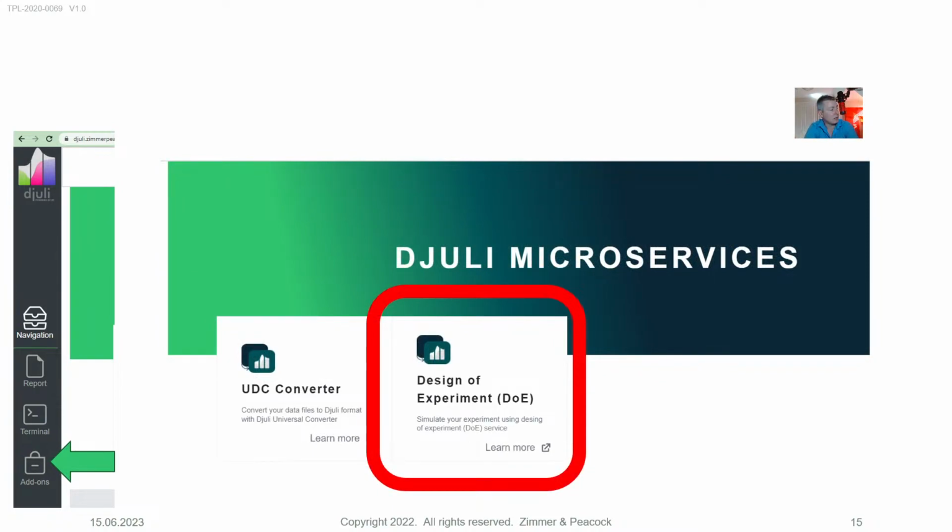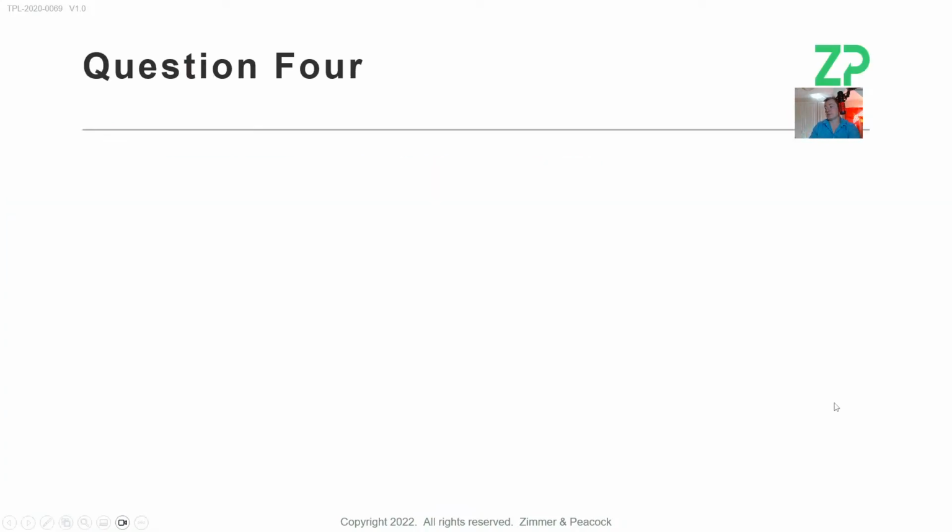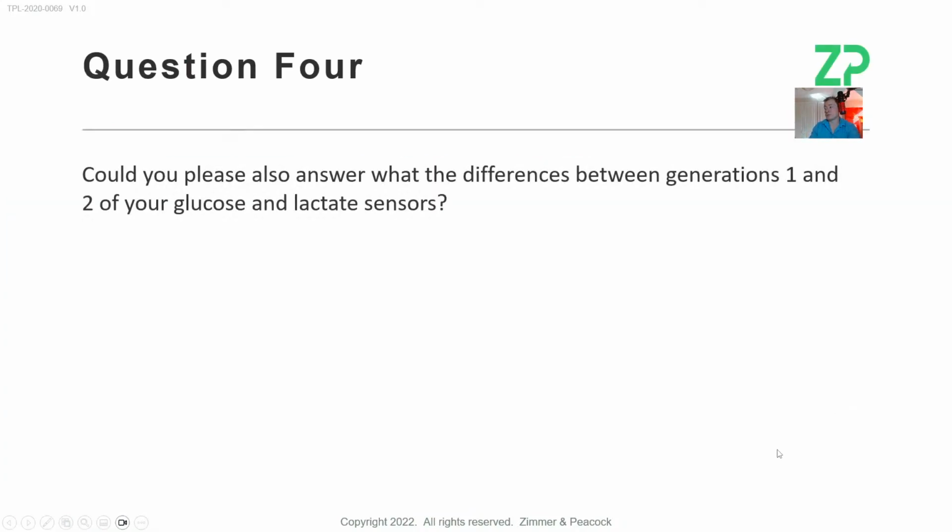The reason I say that is whenever you want to really optimize something, you can just do it by changing some parameters and seeing how signal changes with parameters. For example, in that chloride resilient work I was just trying to describe. But actually you can do a much more structured approach to this, and a design of experiment is a much more structured approach to doing that.